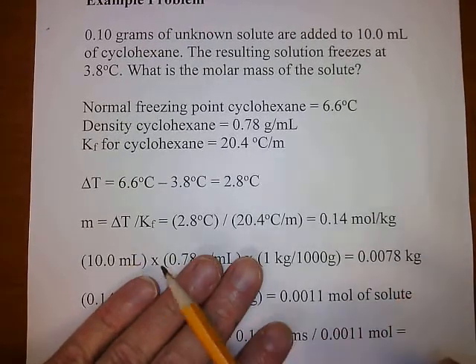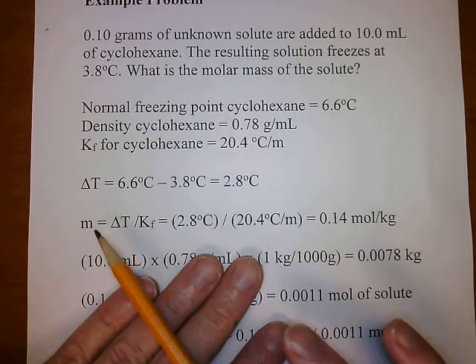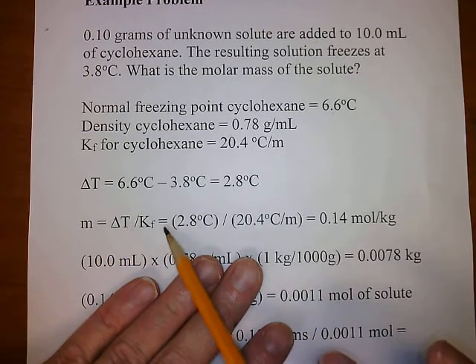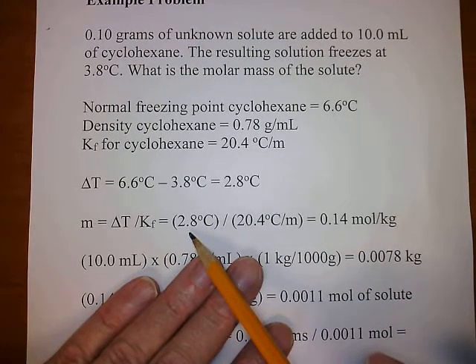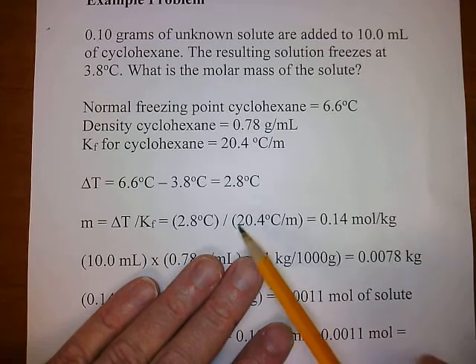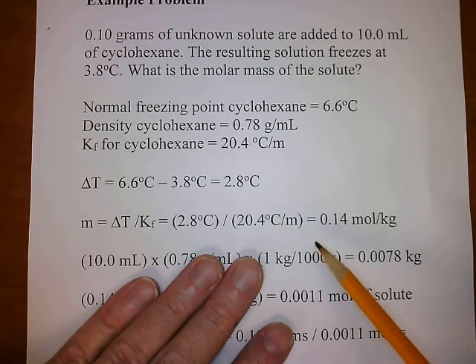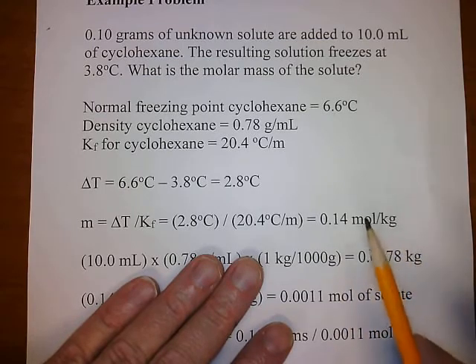That's how much we depressed the freezing point. Now again, we'll take the equation for freezing point depression and rearrange it to solve for molality. Molality is the change in freezing point divided by the constant. So 2.8 degrees Celsius divided by 20.4 degrees Celsius per molal is 0.14 moles per kilogram, right? That's the unit on molality, moles of solute per kilogram of solvent.